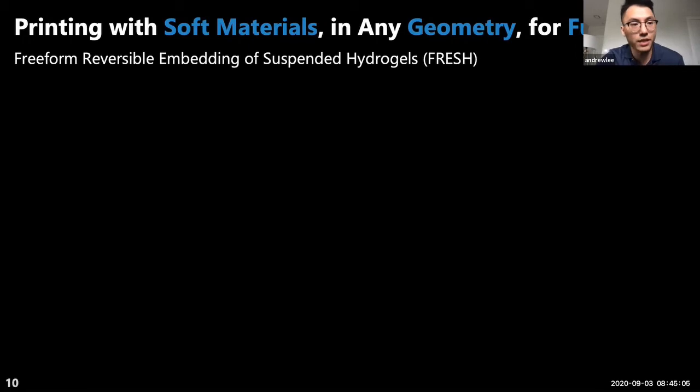And this is why we developed the technology platform that now allows us to print these soft materials in any geometry. And this is the title of this talk, which is this FRESH bioprinting platform, short for freeform reversible embedding of suspended hydrogels.